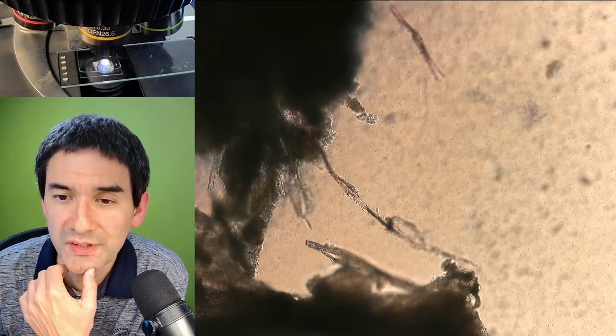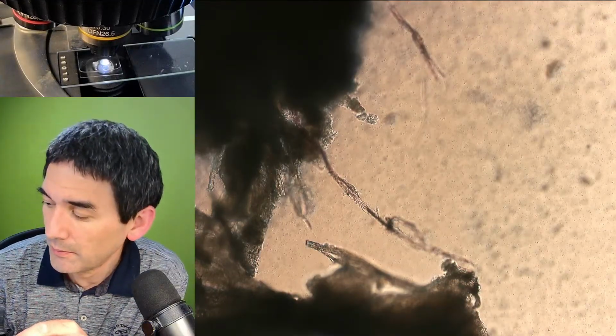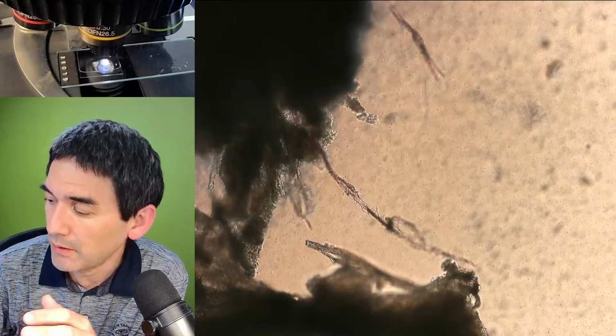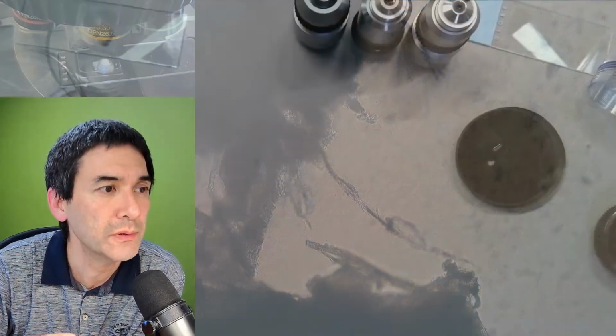Can you show what the polarization and DIC setup looks like? Actually, I thought I just did that. There is a condenser on the bottom.